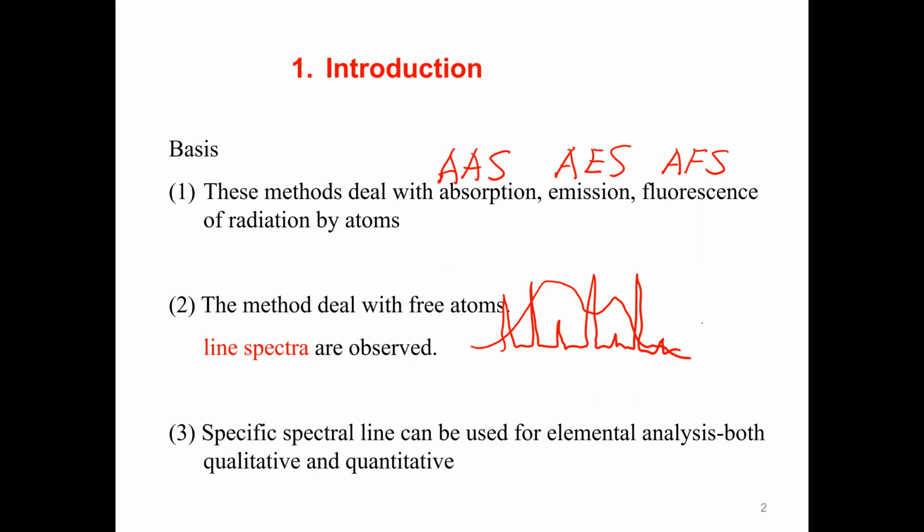each person. By these specific properties, those specific spectral lines can be used for elemental analysis. That means quantitative analysis, but also means qualitative analysis. So that means with this method, we can do both work together.